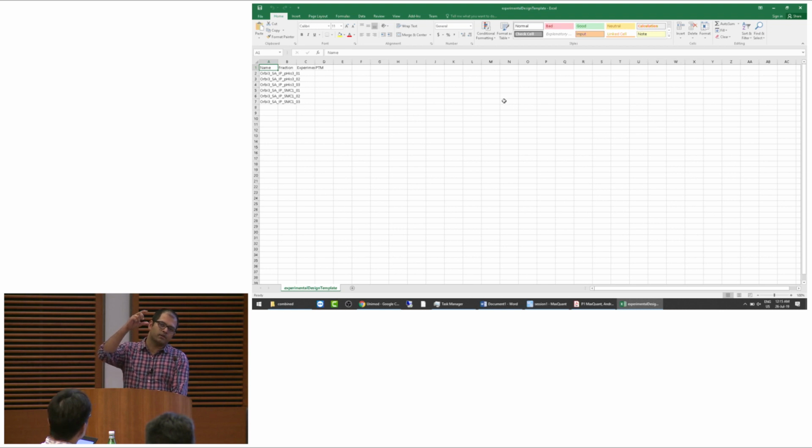So you will say control 1, 2, 3, or like, so you mean like 7 replicates of 3 conditions? Well, if the data files had unique names for, say, the patient, but rep1, rep2, rep3 for reps, and then you have 3 or 4 of those, so 9 or 12 of control, let's say, and then you have another set with the same kind of thing for the experimental or the diseased or whatever.